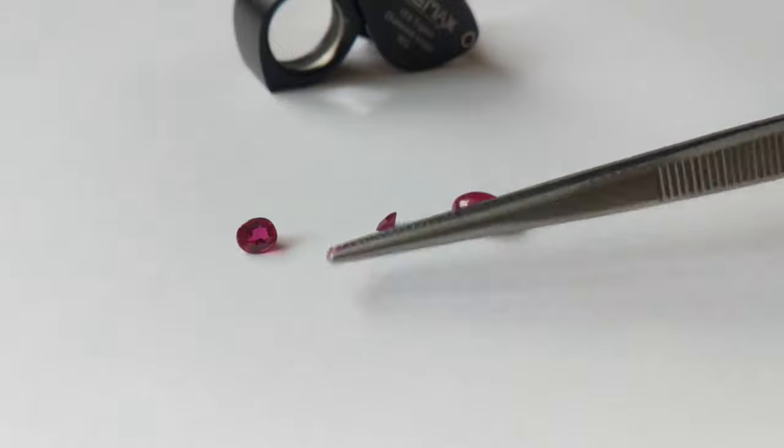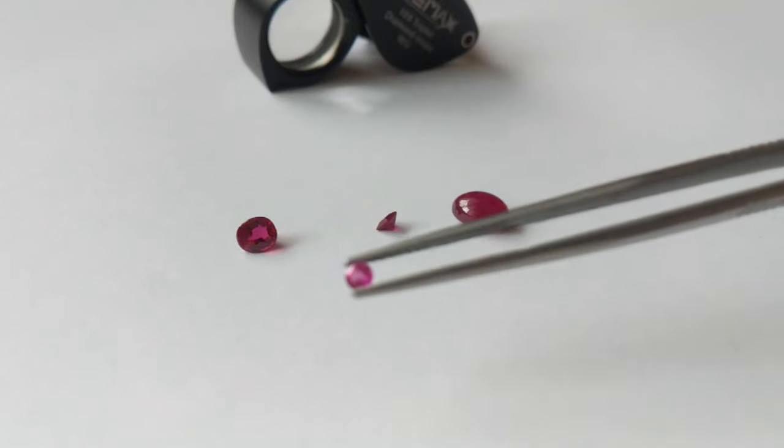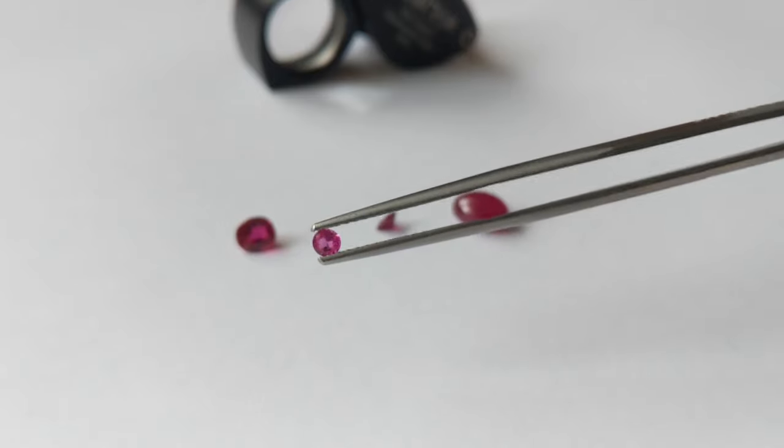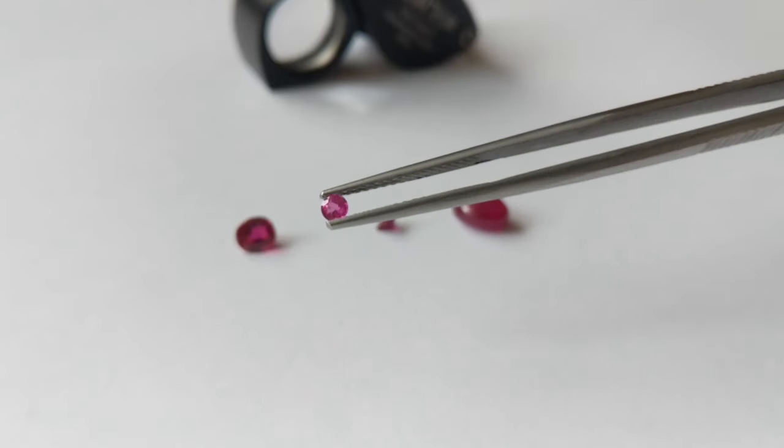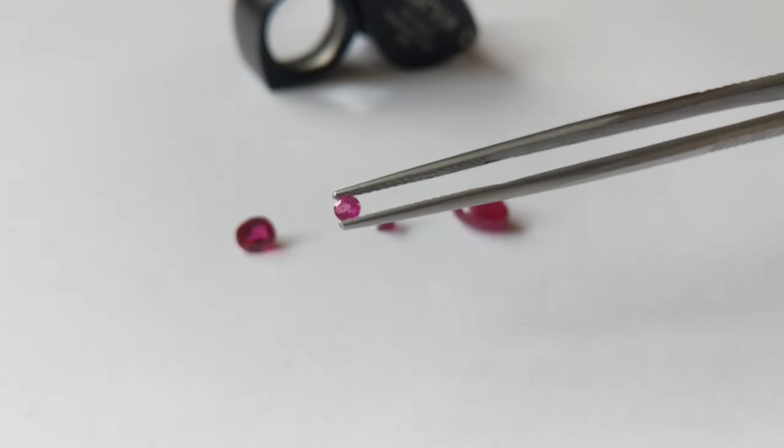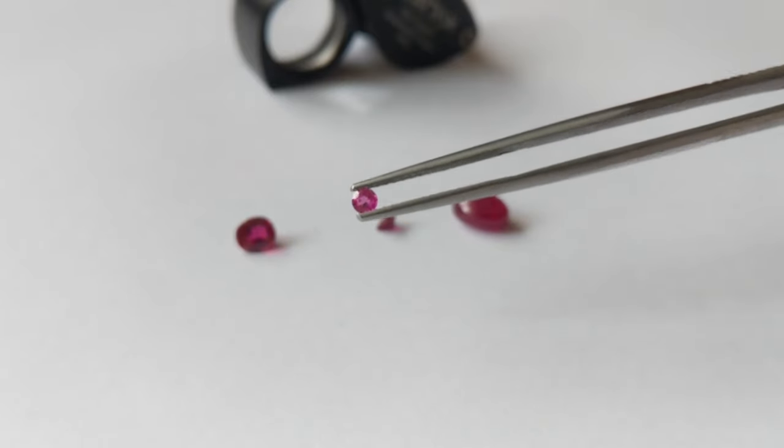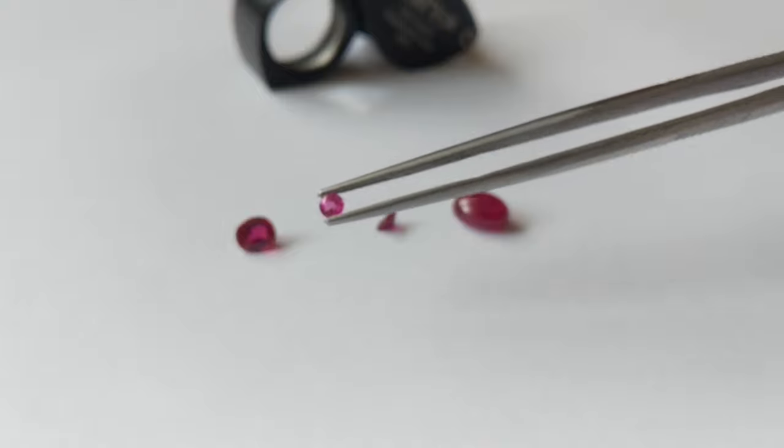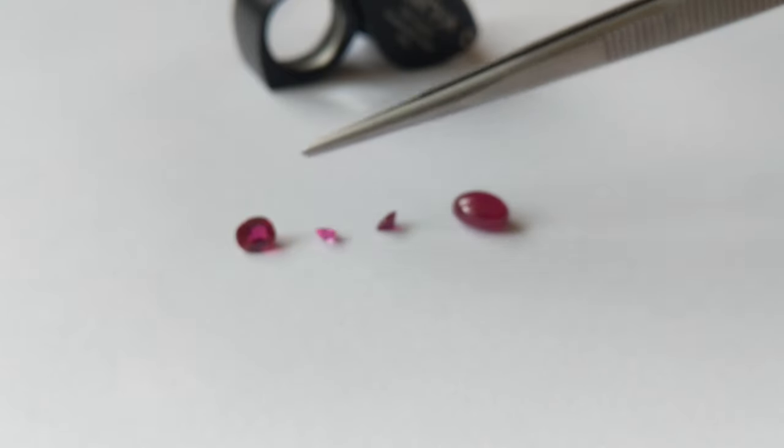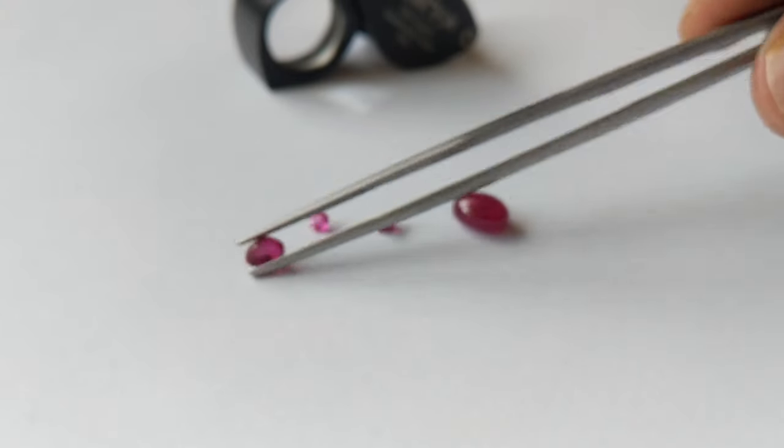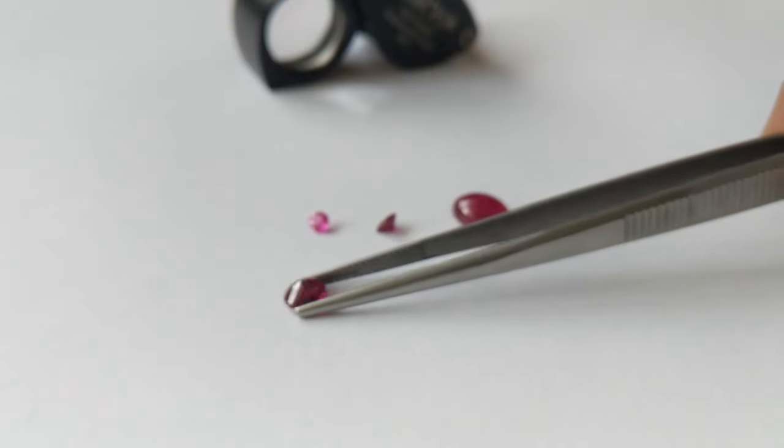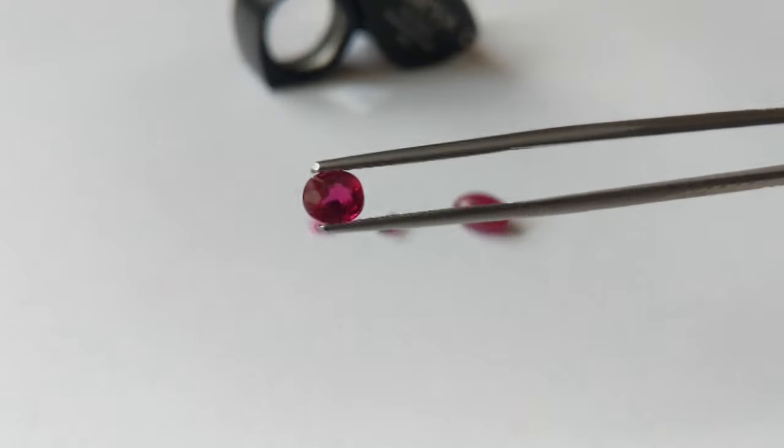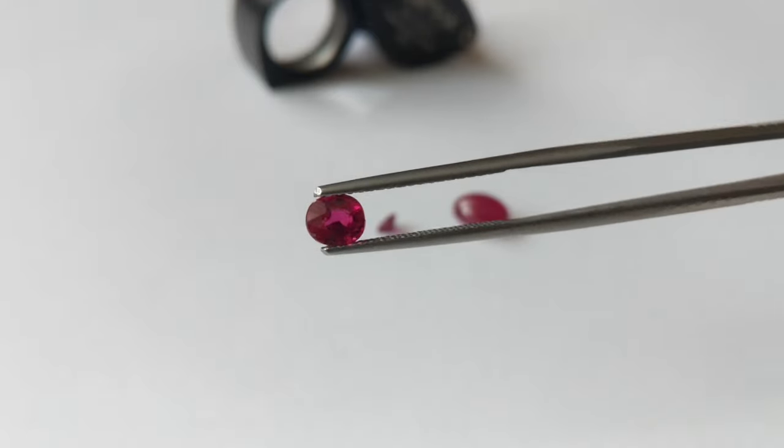Now let's see this third one right here. So the third one right here is a round two millimeter pinkish red, almost a pink sapphire, but it is still a ruby because the red is slightly more dominant color. So do you think this is synthetic or real?